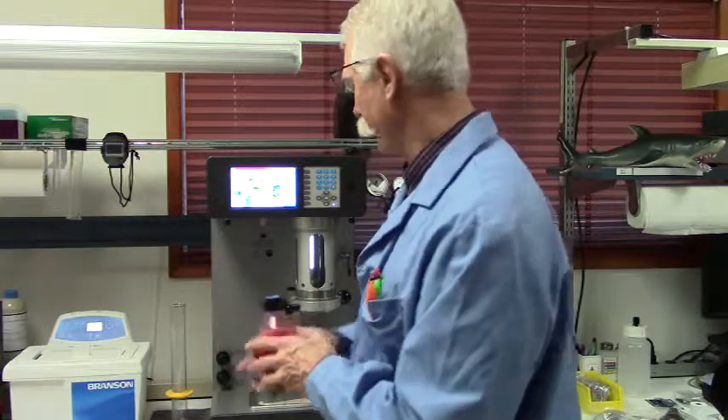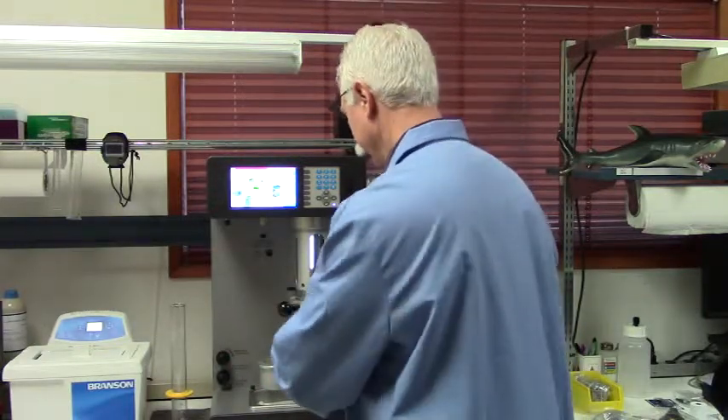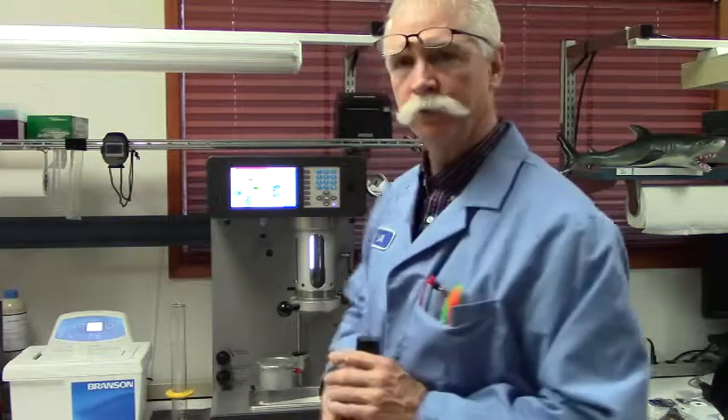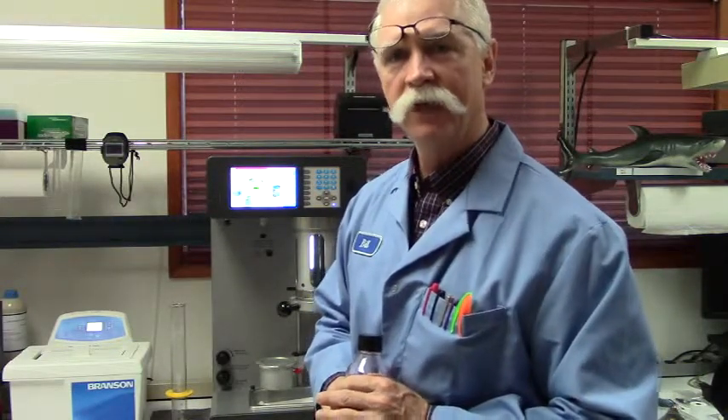Once that's done, remove the lid, put it into your instrument, clock it down, push start on your recipe, and you're good to go.